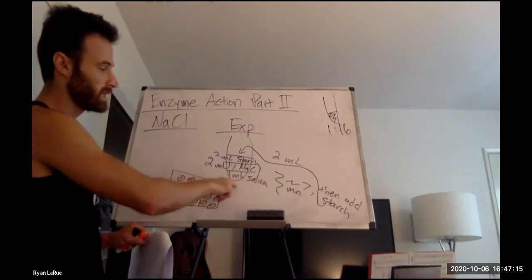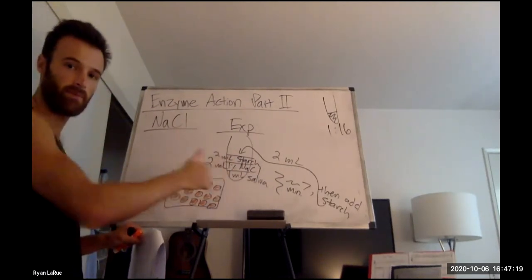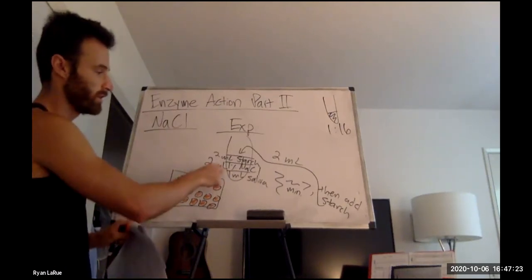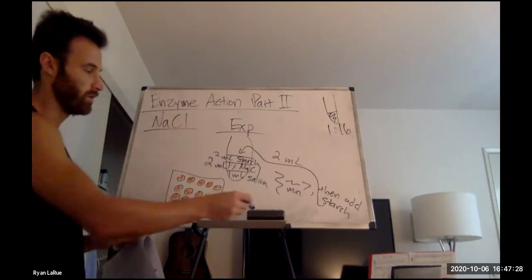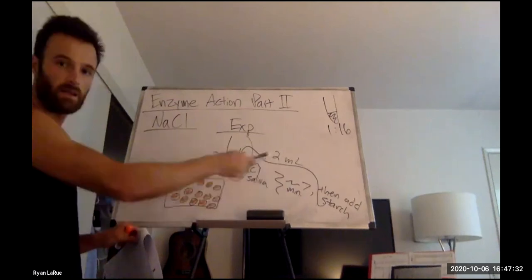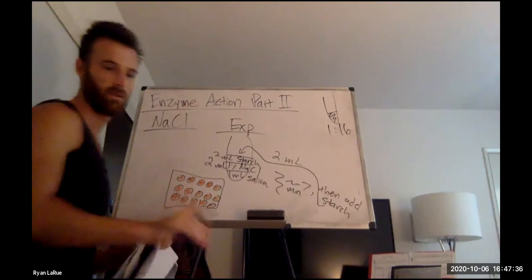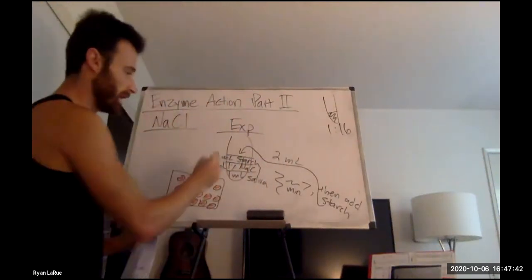After exposing enzyme to the condition, adding starch, you're going to do the 30 seconds after that. And the key here is that you'd have a row for your 1% NaCl, and then after you did a row with that, and these 30-second intervals, you'd replace it with, what is she at, 2%? 5%. So you try the same thing on the next row.